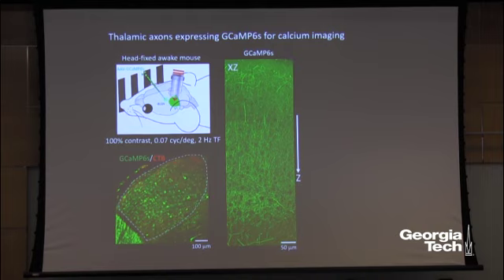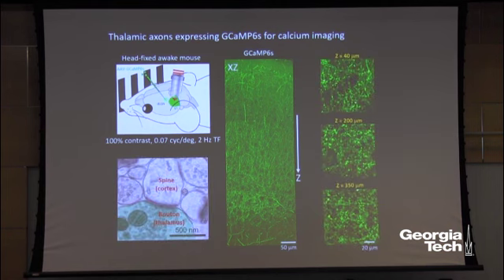Now this is just a confocal slice showing you how the axon distributions are. With the help of adaptive optics, we can image those axons, and the individual synapses on those axons called boutons, at very high resolution, even hundreds of microns below the surface of the brain. And you can see there's not much difference in the image quality we obtain here.